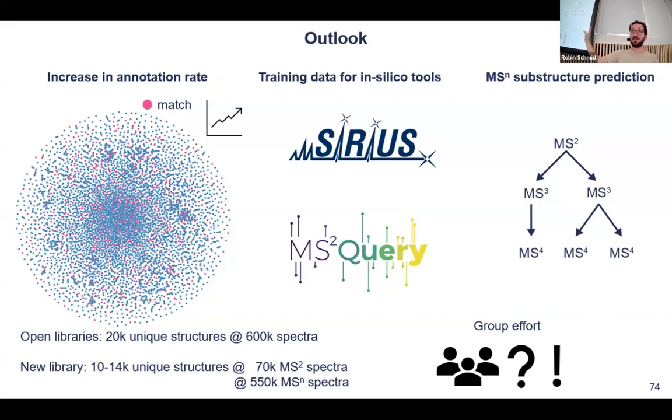be a huge increase. And we've seen that with language models and so on, and image recognition, that even unlabeled data is very useful and can be used by people, right? So even mass spectra that do not have much metadata can be useful for people to train machine learning models and understand and make sense of mass spectra in general. So they can generalize from that idea. So we can see what comes up in the future.